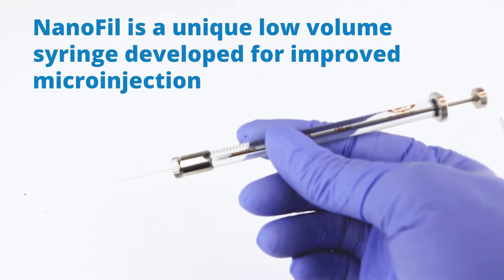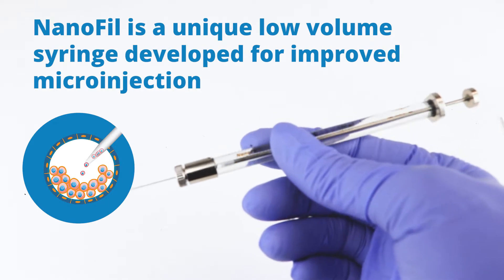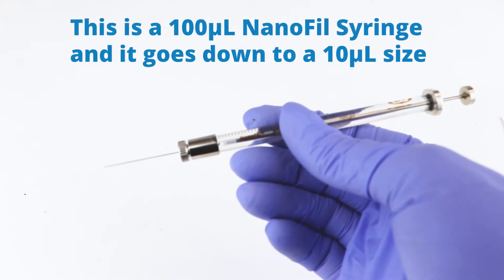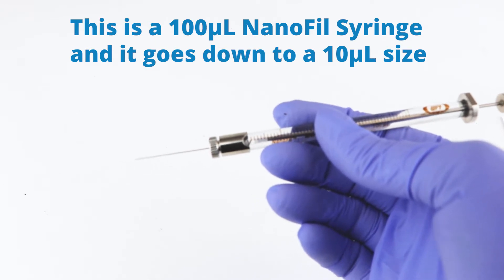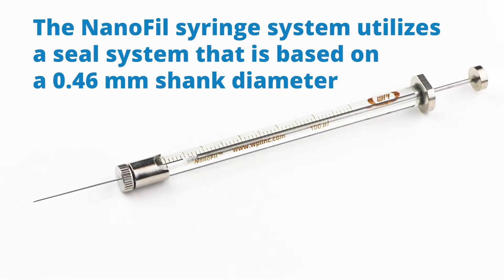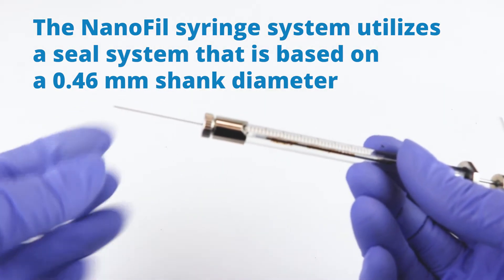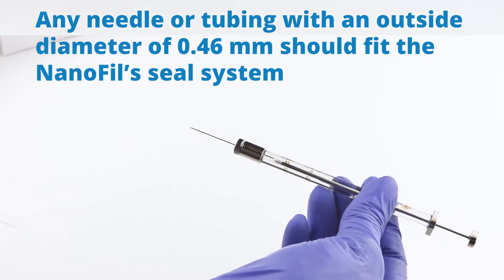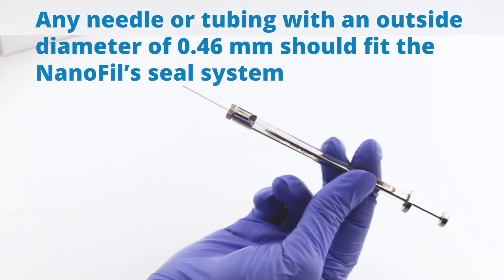Nanofill is a unique low-volume syringe developed for improved microinjection. This is a 100 microliter Nanofill syringe, and it also goes down to a 10 microliter size. The Nanofill system uses a seal system based on a 0.46 millimeter outside diameter for the shank, so any needle or tubing with an outside diameter of 0.46 should fit the Nanofill system.